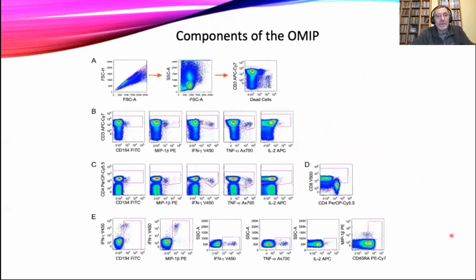And we also get a gating tree, as we saw earlier from what Kathy was doing: single cells, scatter gating, live cell gating, and then looking at the CD3s and either the CD4 or the CD8 population, and then the expression of those functional markers.